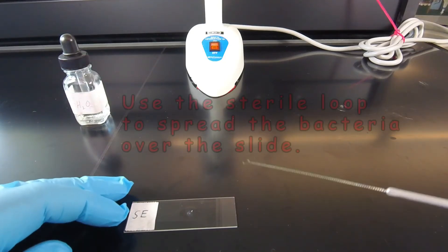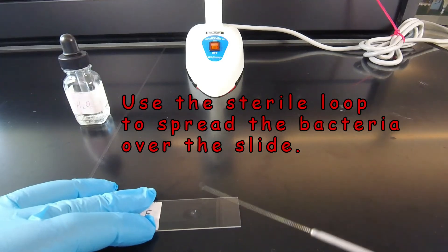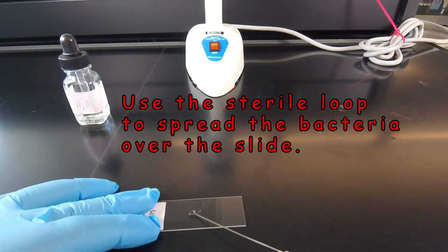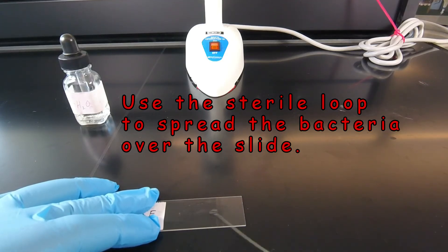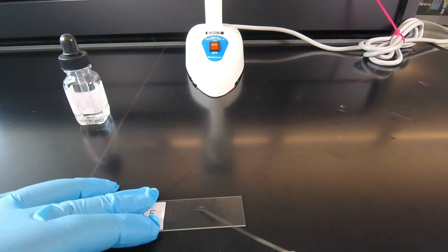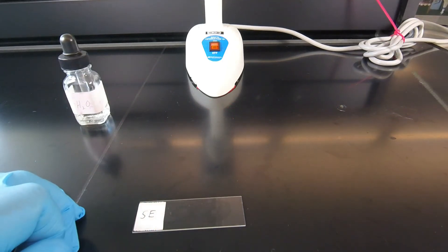So now that the loop is cool, we take our sterile loop and we're going to spread the bacteria that we added to the water over the slide. And notice we're spreading it out over a good portion of the slide. The better we spread it out, the thinner the smear, the faster it's going to air dry and the better we separate the bacteria.